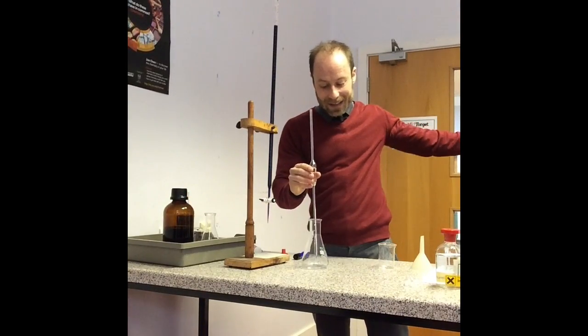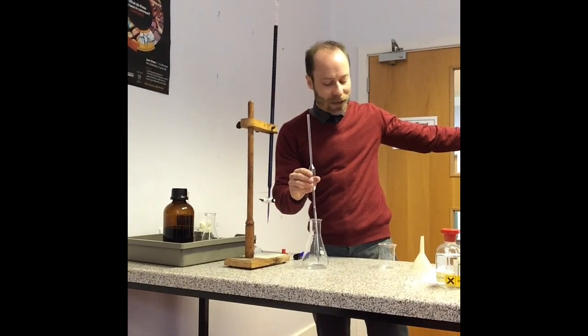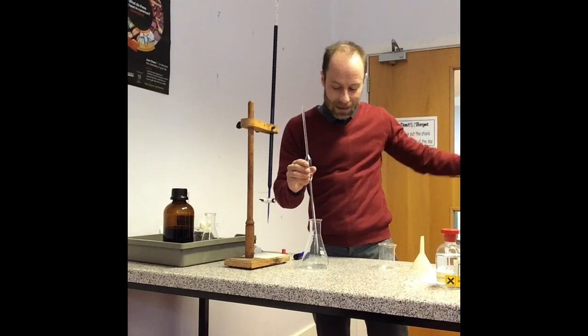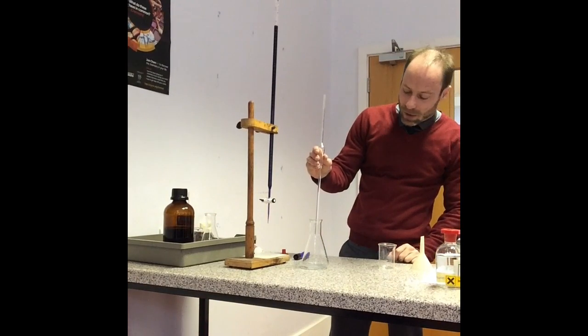What do I need to add to get the titration to work? Acid? I do, yeah. Do I need to worry about how much acid I've got? As long as I've got lots of acid there, it's okay. So I'm going to add about 10 centimetres cubed of sulfuric acid, just to give me those H plus ions to make sure it's all hunky-dory.